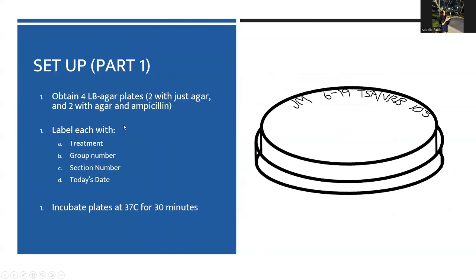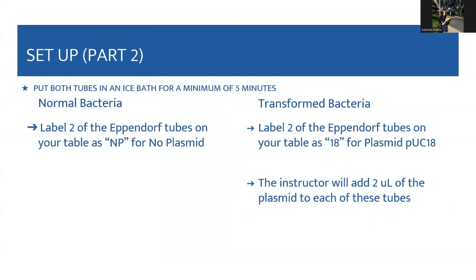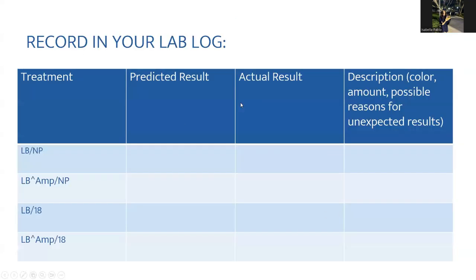All right, this is the setup that we did. Again, incubated the plates at 37 degrees for 30 minutes. That's to make them hot in order to obtain that heat shock. Okay, this was the setup that we actually did. And then this is your lab log.